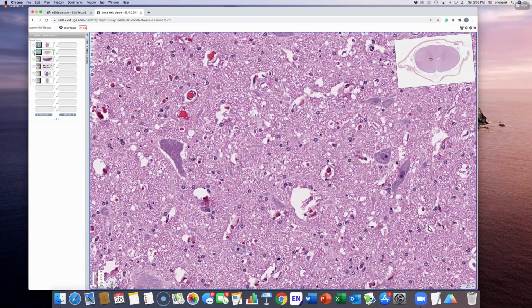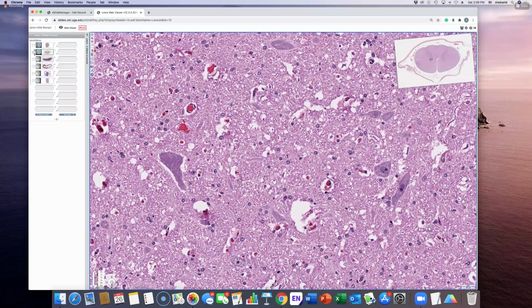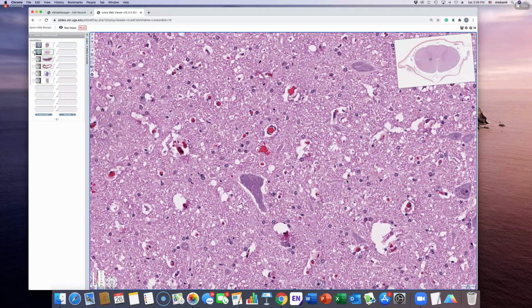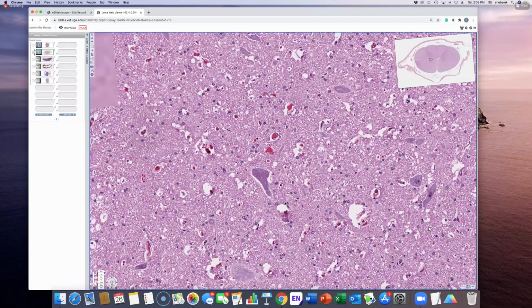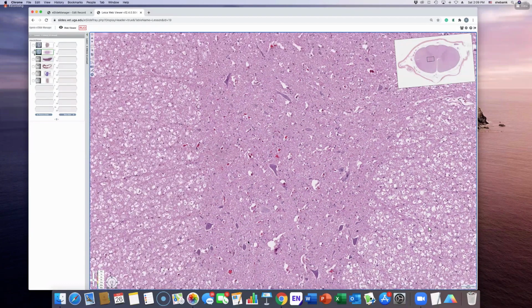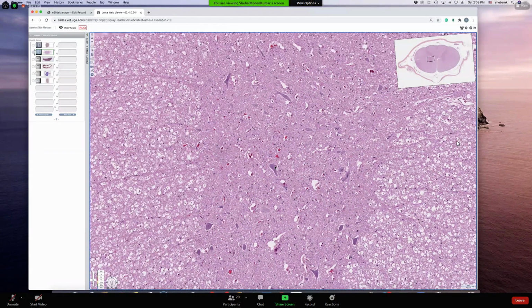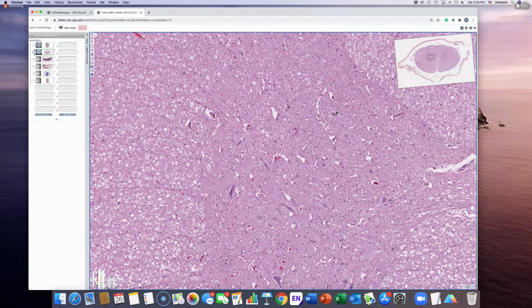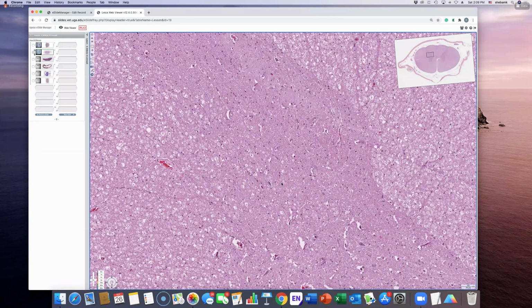So what is the rest of this background called? The neuropil. Yes. Okay, so because we are in the ventral horn, what kind of neurons are these? Motor neurons. So if we were in the dorsal horn, then these neurons would be interneurons. Awesome. Okay, so that is that. That's all we have for the spinal cord.